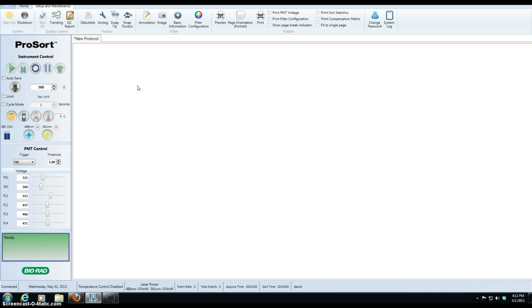The Avalon was tailored to sort cell lines expressing fluorescent proteins. There are basically two lasers in this box. The first one is the 488 nanometer laser. The second one is 561. So we can excite GFP, DsRed, and mCherry, dTomato, as well as a handful of fluorophore markers, so FITC, PE, PerCP-Cy5.5, PE-Cy7, and so on. No APC, although you can excite it off the 561. The excitation is not as efficient as with a regular red laser, and no Brilliant Violet dyes. We don't have a violet laser on this machine.